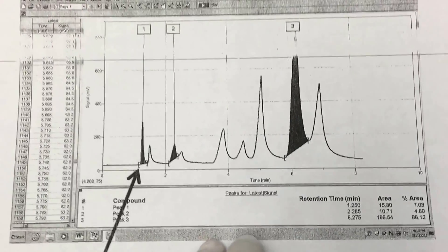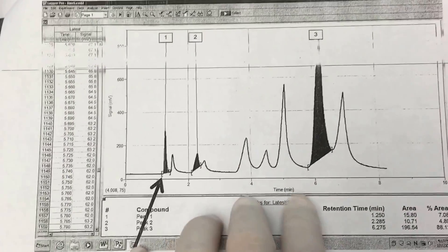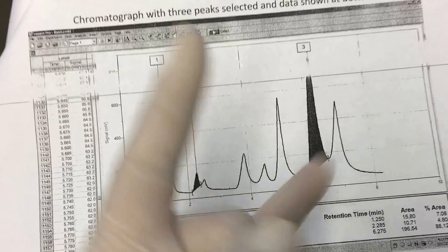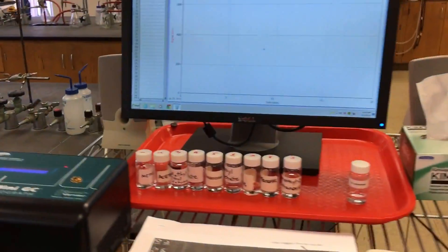You can then do further analysis in Excel or Prism to plot certain things. That's all for today — hope you like it. This is the Organic Chemistry Lab.